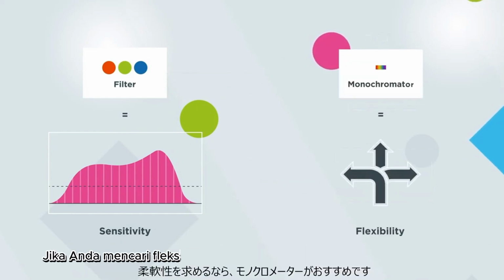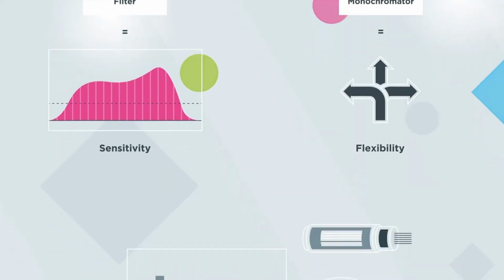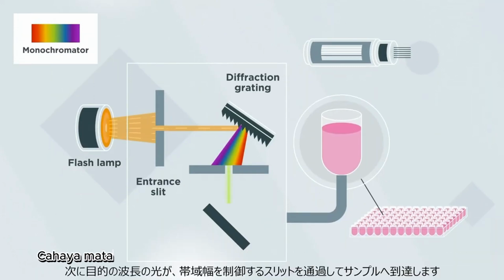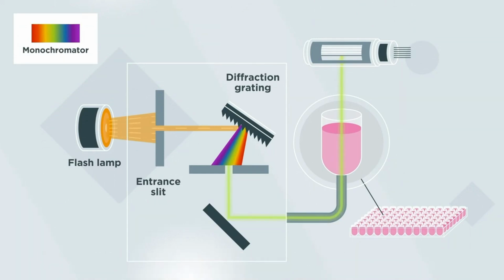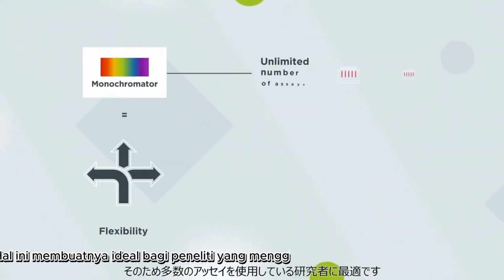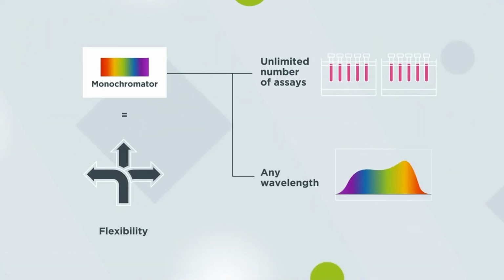For higher flexibility, a monochromator instrument is a better choice. Here the light encounters a diffraction grating that splits it into a spectrum. Then the light of the desired wavelength range is passed through a slit which controls the bandwidth that reaches the sample. A monochromator instrument lets you use any wavelength, making it a perfect choice for busy labs where each scientist is working with a different assay.